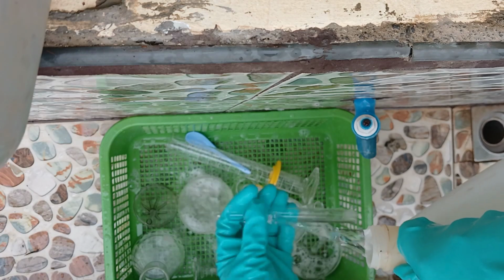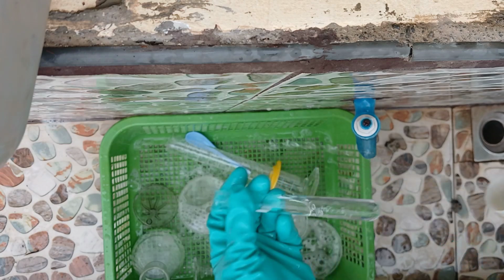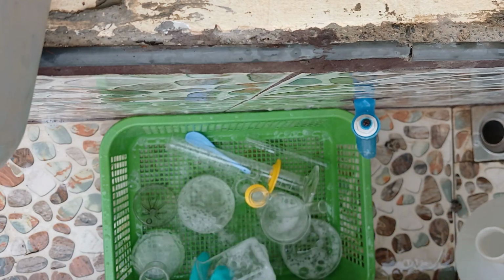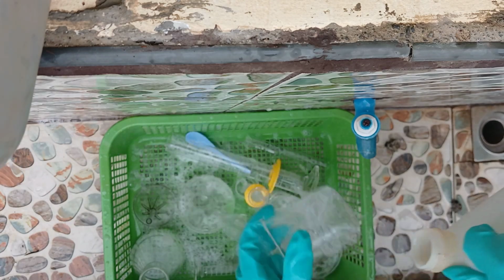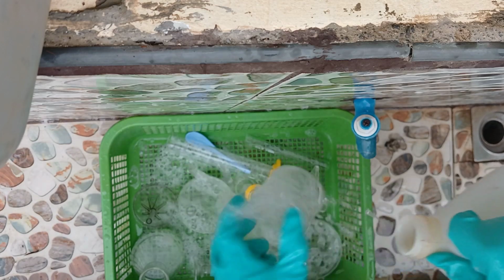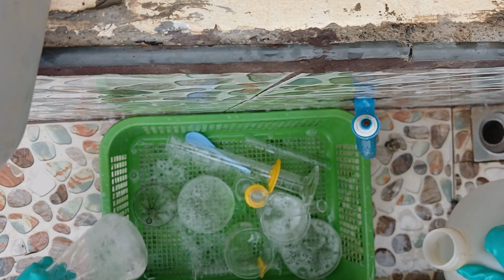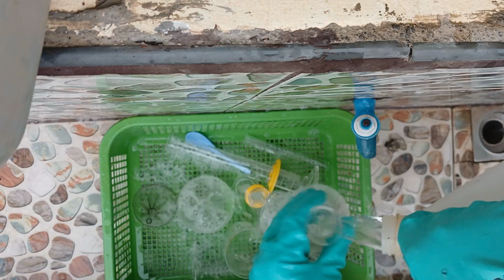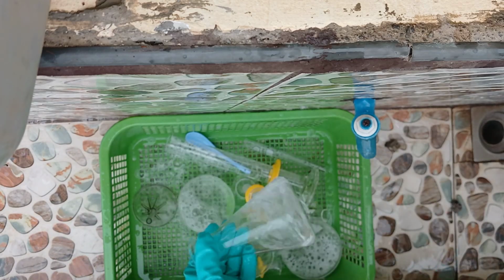Cleaning and drying. After cleaning, you may let it dry using a white cloth or other means. If you don't need it right away, let it air dry, or dry it in the oven, as there are a lot of techniques to dry it. Okay, if you are done, then that's it. Actually, this is how you handle solid and liquid chemicals, and then clean and dry glassware.